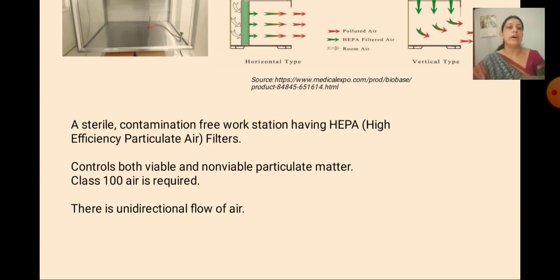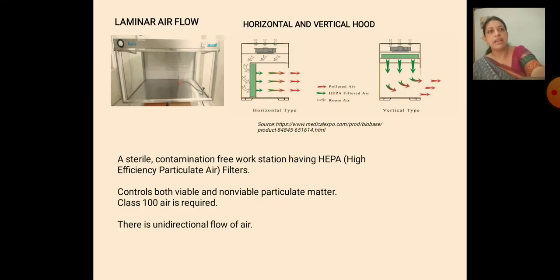So all the work done in the microbiology laboratory, that is inoculation, subculturing, plating, all these types of small works, are carried out in this workstation, because it is a sterile unit. The entire room cannot be as sterile as the laminar airflow. And remember, the entire air circulation is unidirectional.